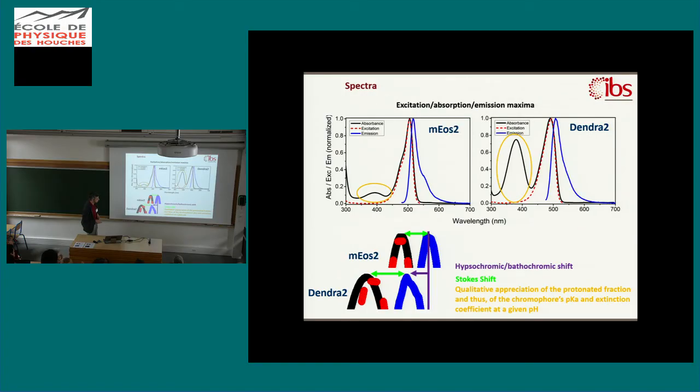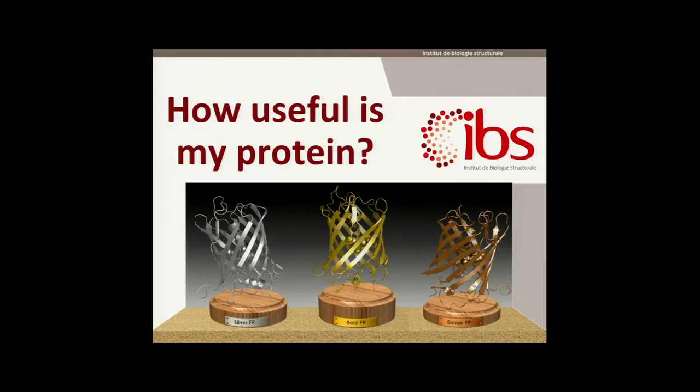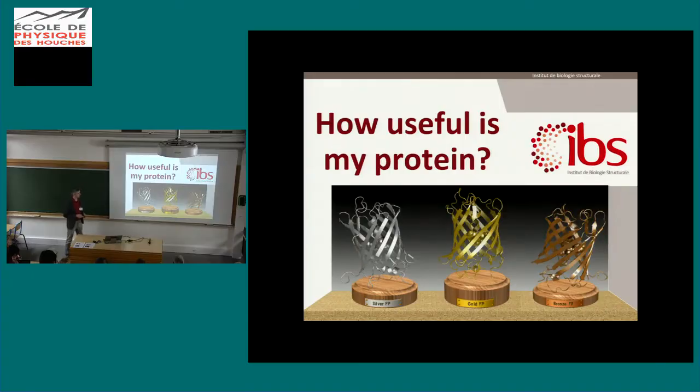So the qualitative appreciation of the protonated fraction, and thus the chromophore pKa, and thus the extinction coefficient at a given pH, because if it absorbs less here, it must mean that the extinction coefficient of the anionic state must be lower, because the protein is in the other state.